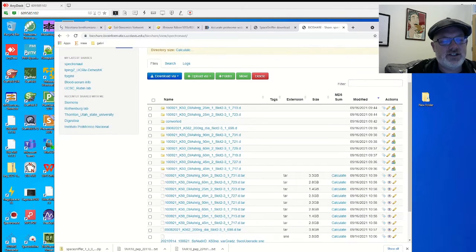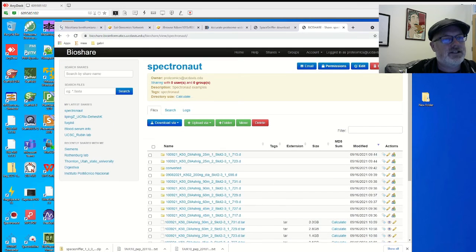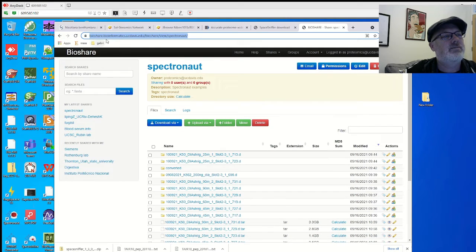All of these files, you can download them or not, it doesn't matter. But all of them can be found on this website here, bioshare.bioinformatics.ucdavis.edu/bioshare/view/Spectronaut. And feel free to pause the video at any time. I go kind of fast, but since it's a video, you can pause it, rewind it, and do all sorts of things. So if you want to download this data, great. If not, just follow along.